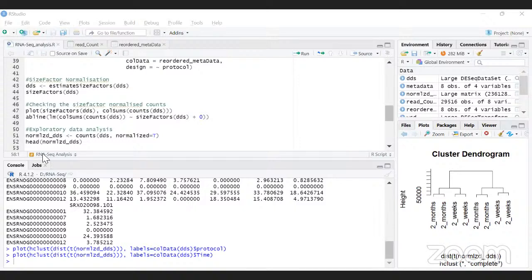It will, because what you do in downstream analysis is look at pathways that are actually being changed, right? If your end analysis is to look at pathways that are changed, for example upregulated or downregulated in a tumor cell, you would definitely want to stick with genes, because you already have several gene sets that pertain to a particular pathway.